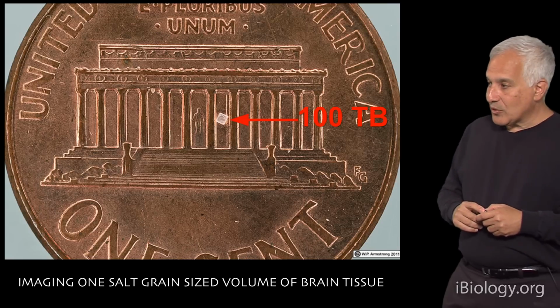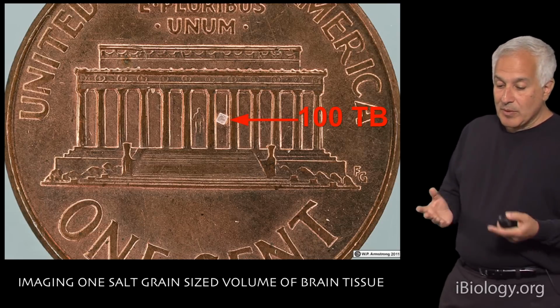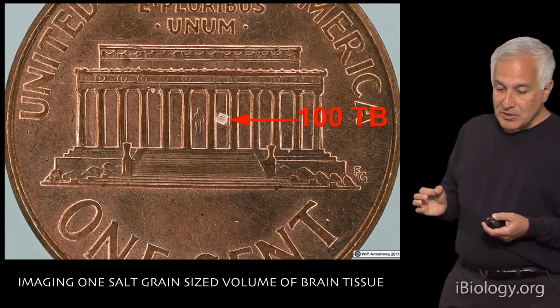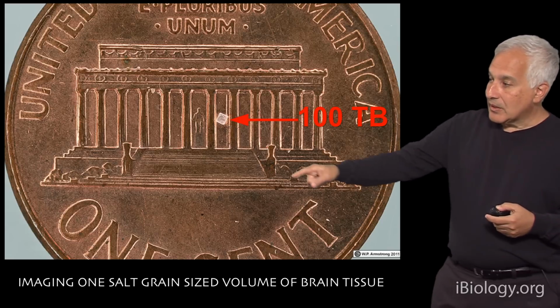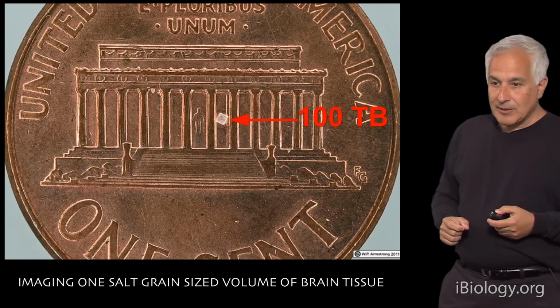Josh Morgan did all the work of taking this image data, and that image data is really a tremendous repository now, because at that resolution that we've taken the data, we can see every synaptic vesicle in every synapse in something that you might think is small, but for us that's a pretty large amount of data.